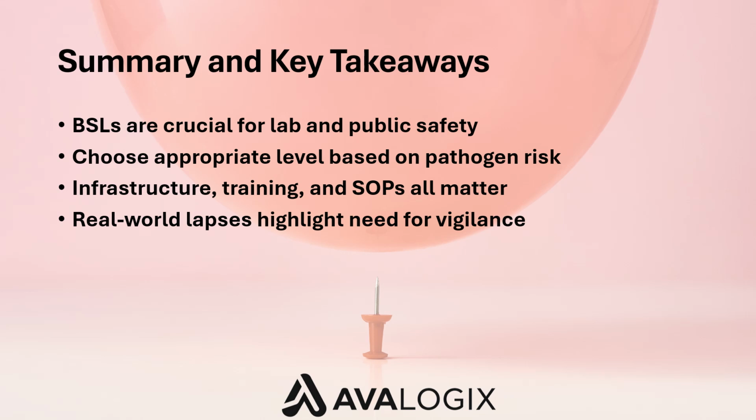We've discussed the importance of containment equipment like biosafety cabinets and the value of proper practices, SOPs, training, and waste management. Real-world incidents show us what can go wrong, and regulatory frameworks guide us in doing things right. Biosafety is not static. It evolves with new pathogens, new technologies, and new global risks. As future scientists and lab professionals, your role in upholding these standards is both a responsibility and a form of service to society.